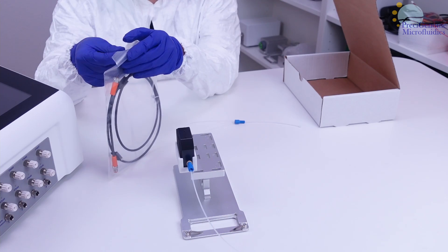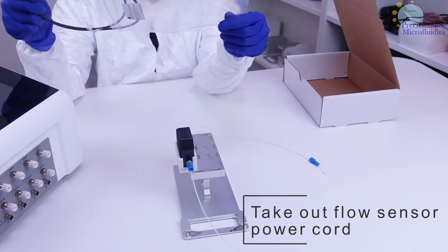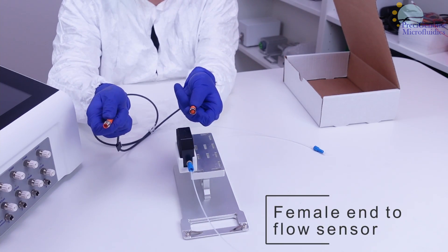Once your tubing is connected, take out the flow sensor power cord, and note its ends. The female end goes to the flow sensor, and the male to the pressure controller.